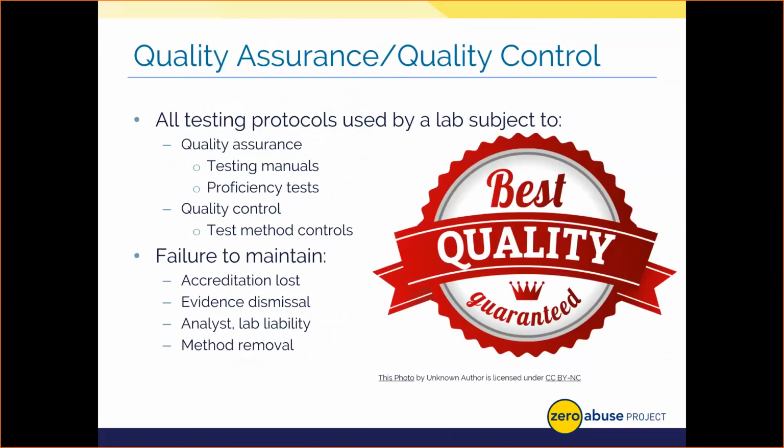All right, let's go ahead and shift our focus to a discussion regarding how we know your results are of a high quality and provided through rigorous testing methods of value that are scientifically accepted. So we have quality assurance, or QA. Now this is process driven and focuses on preventing any defects or issues in our testing procedures. A good example of quality assurance in a forensic testing lab is the development, evaluation, and dissemination of standard operating procedures. At labs where I worked, we had a constantly updated test method manual.